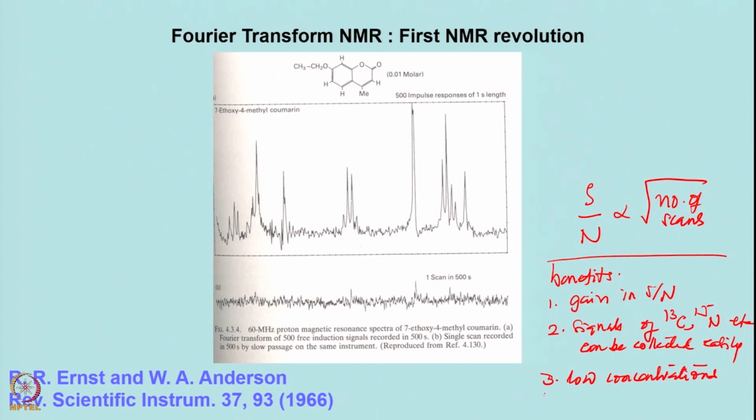And then the fourth, kinetic phenomena can be studied, because since you are able to collect the data very rapidly, you can do it as a function of time. Okay, and then let me write the fifth here, unstable molecules can be studied.